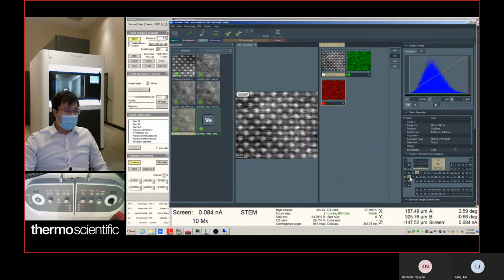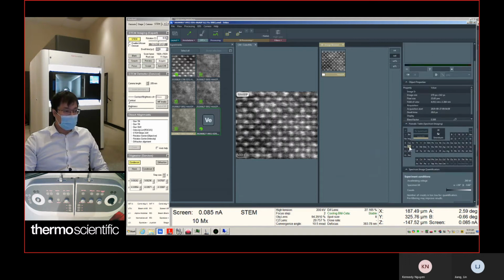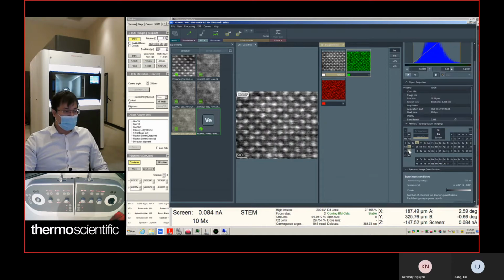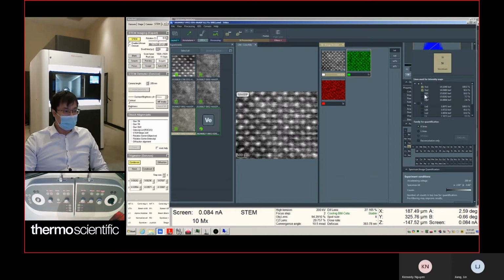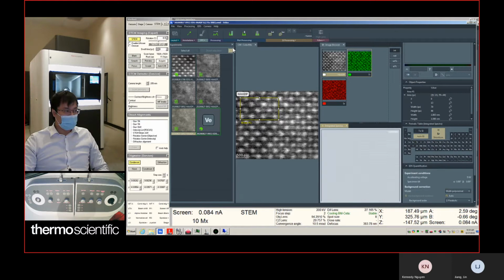You can select which element you want to include, and when you select a different element, it gives you the option to select. Also, if you go to intensity, it gives you the option to select which energy peak you want to include. Usually we choose the K peak. To know how to choose different peaks, it's good to check the spectrum. You can use the spectrum tool.